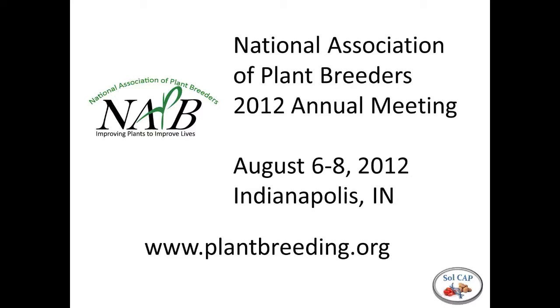And a question here. I know you looked at the Kosambi mapping function. Is there another function used to estimate recombination frequencies? Yeah, Haldane, which is an option, of course. And the difference between Haldane and Kosambi is that the Kosambi function has a factor in it to assume that there is interference between closely linked markers, whereas Haldane does not.